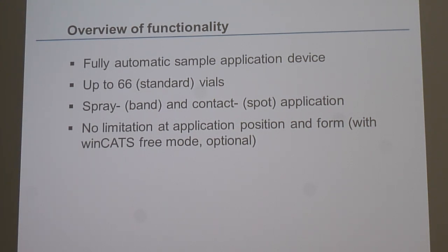But free mode is also good for big volumes. If you can make 3 or 4 bands, then make fixing, then start development. This was much better. But you can also make it here. You can make some lines, or you can also spray areas. This is also possible. I don't know if it's mentioned here: we have a heating nozzle. Okay, that we have mentioned. It's an option. And what we can do is not only spray in lines, we can also spray in areas. With the ATS4 it is also possible, and you can make a big area.